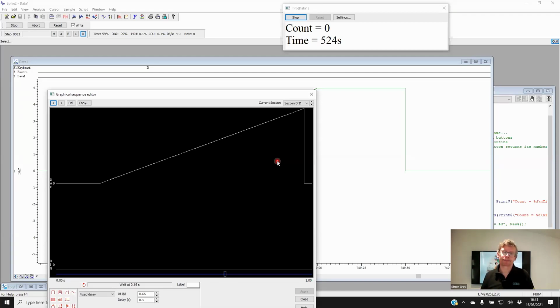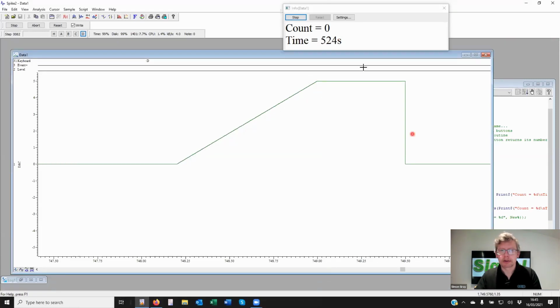Going back to the clock output, I'm sure some of you have wondered what the clock is on the front panel of the 1401. Well, that gives a pulse out every time there is an instruction executed within the sequencer. So it will output pulses at 1000 hertz in this case, because I'm running the sequencer at 1 millisecond resolution. And of course that rate will change if I change that resolution. Right. Okay, so I think we should get to waveform output.